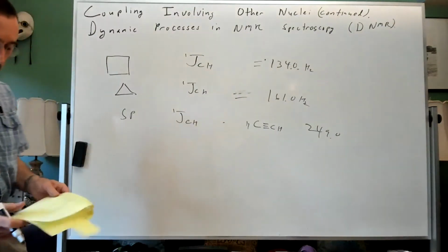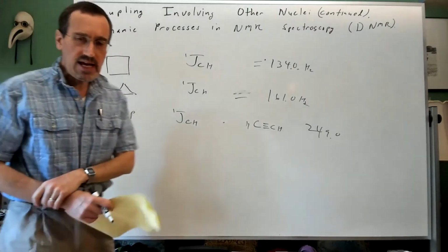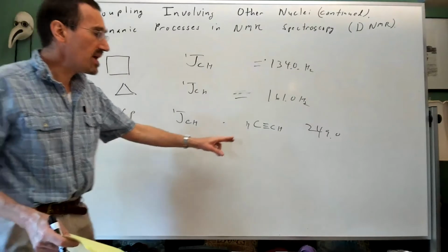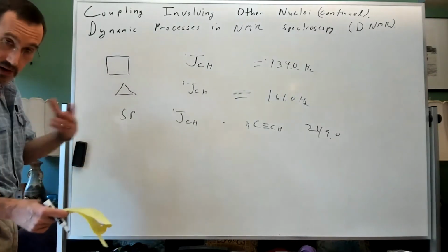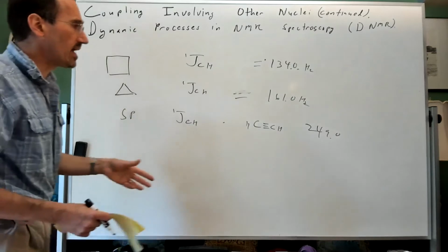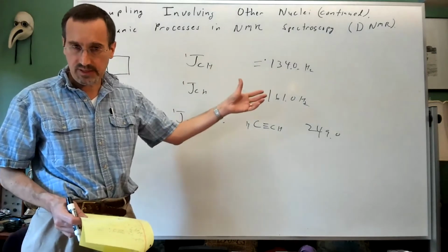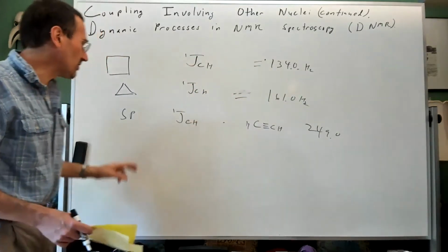All right, so the implications of this are important. In spectral techniques based on a typical CH coupling, things like alkynes may behave in ways you don't expect. In other words, a technique like DEPT or HMQC, which we're going to come to, is based on a typical CH coupling that normally for everything else would be on the order of about 125 to 160 hertz. So you can maybe pick an average value and kind of split the difference and say, okay, we'll use 140 hertz as an average J1CH. That works very badly for alkynes.